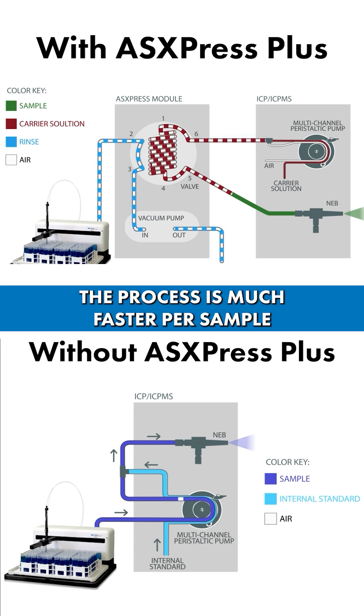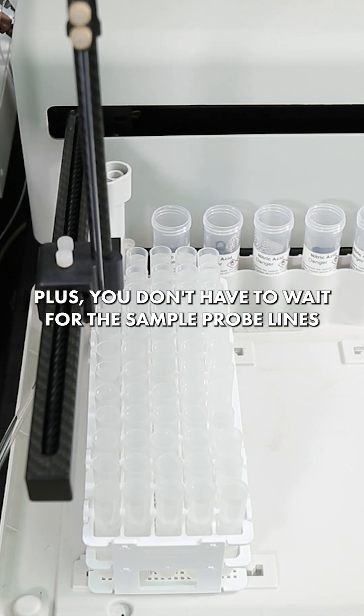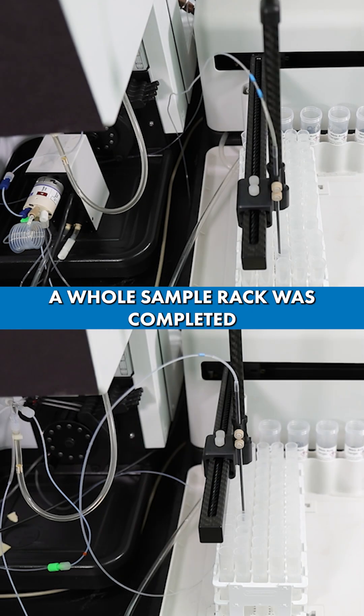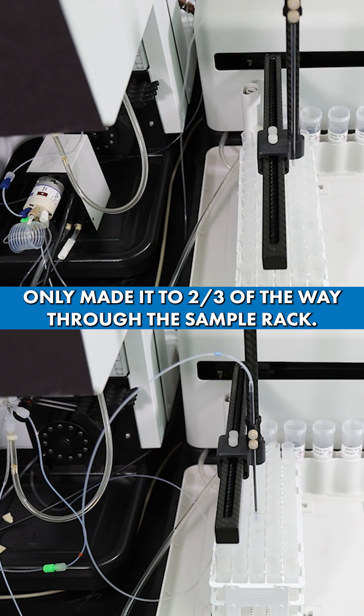The process is much faster per sample with the AS Express Plus compared to using the peristaltic pump alone. Plus, you don't have to wait for the sample probe lines to empty of sample before washout can begin. On the top video with the AS Express Plus, a whole sample rack was completed, while the bottom video without the AS Express Plus only made it two-thirds of the way through the sample rack.